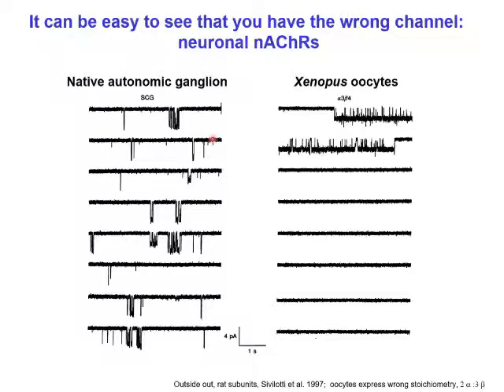But I'm going to spend now a couple of slides telling you about measurements and telling you why we must be careful even with amplitude measurements. Now, it's pretty clear that here you need the electronic equivalent of a double ruler to measure this conductance, or rather how many picoamps there are, and then go to the conductance.